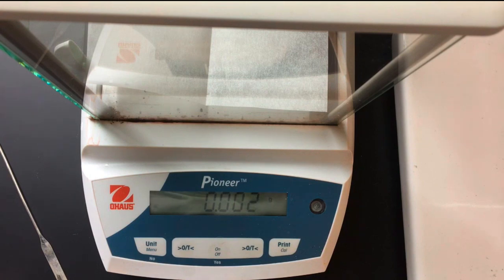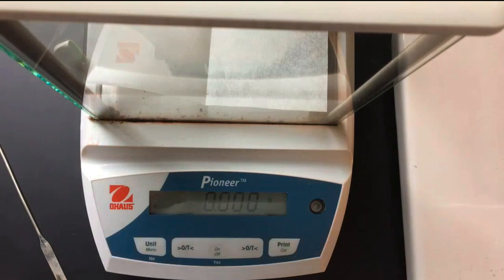So to begin, we're going to start by making our stock solution that we will later dilute in the lab. In your pre-lab, you were supposed to calculate the amount of Allura red, also known as red dye 40, that you need in your stock solution. And so we're going to go through the math quick.